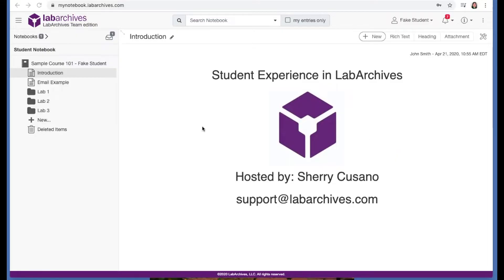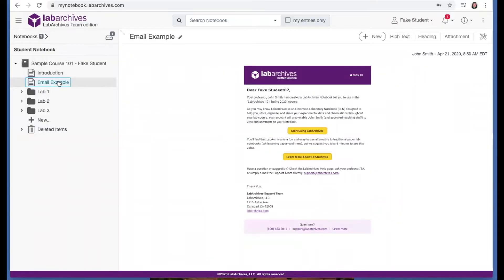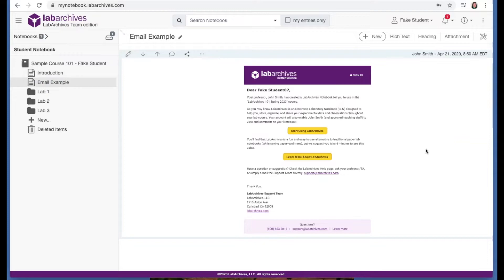Your instructor may provide you a link to sign up for LabArchives, or you may receive an email inviting you to your course like this one. Either way, you'll follow that link to create an account to access your course notebook.